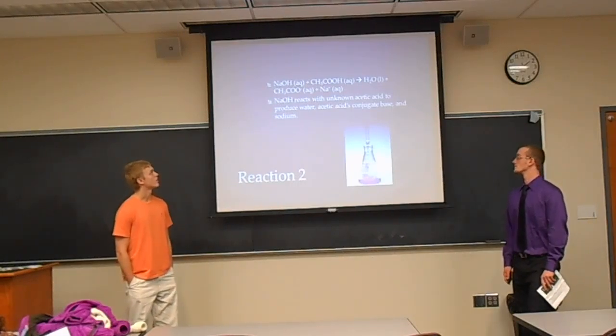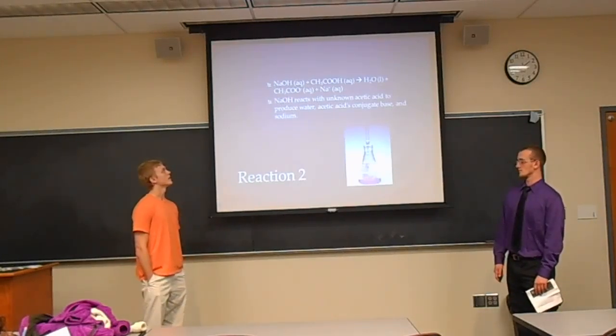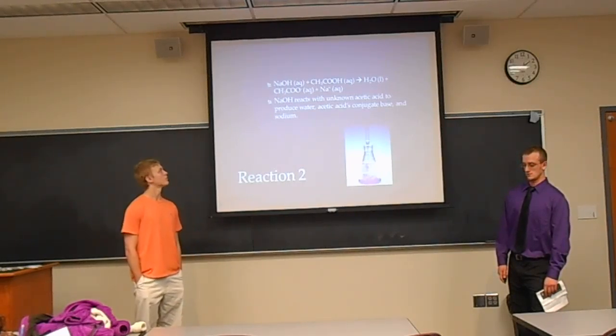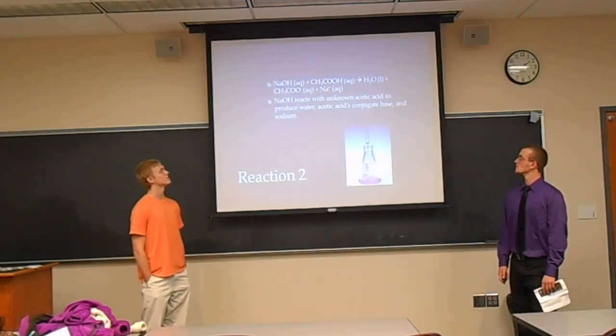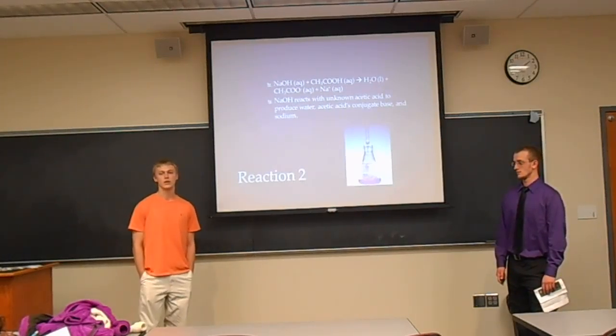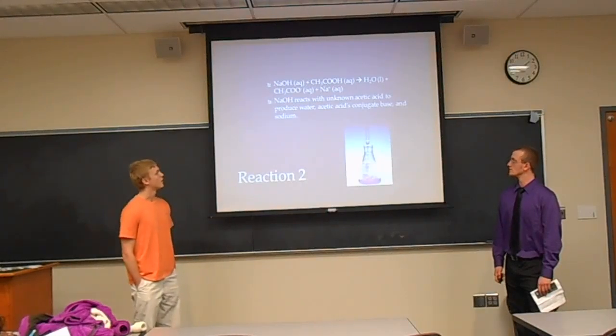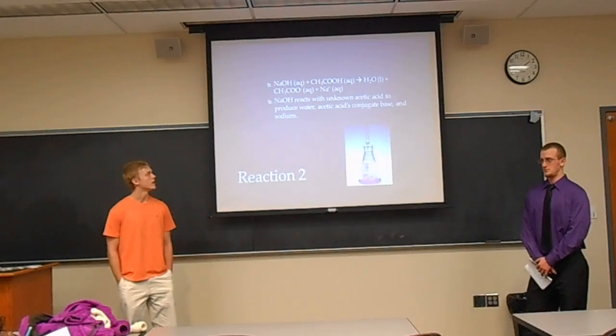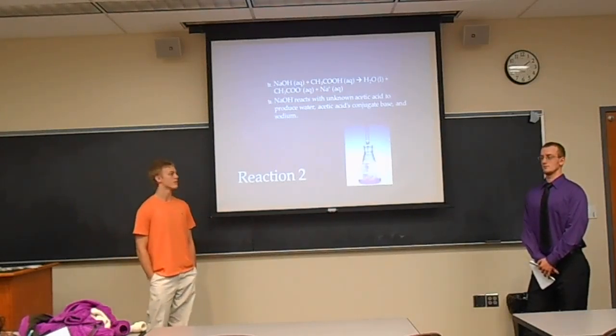Right here is our equation, which is NaOH plus the acetic acid forms water plus acetic acid's conjugate base and a excess of Na or sodium. The NaOH reacts with unknown acetic acid to produce water, and like I said, the base and sodium.